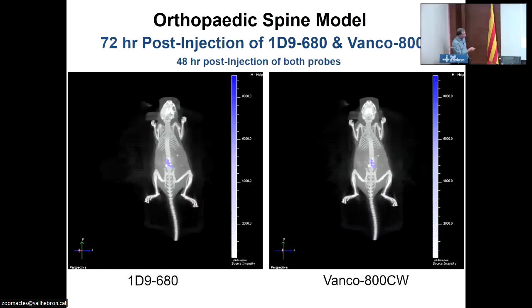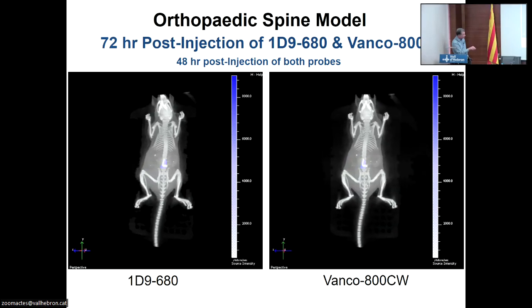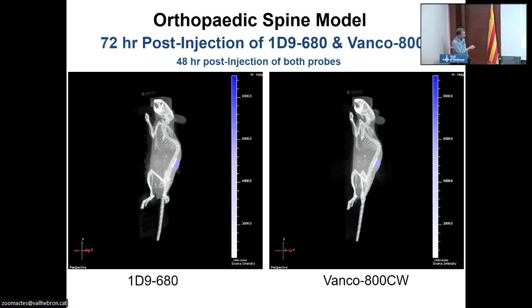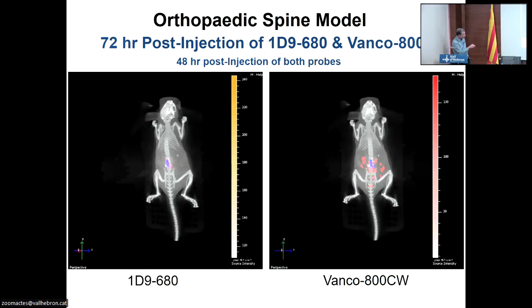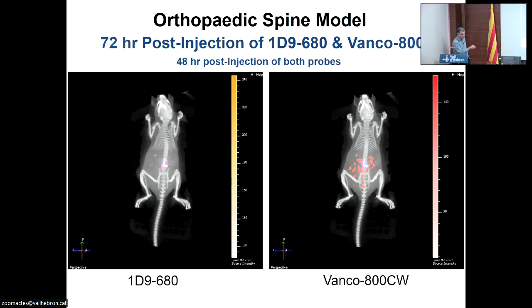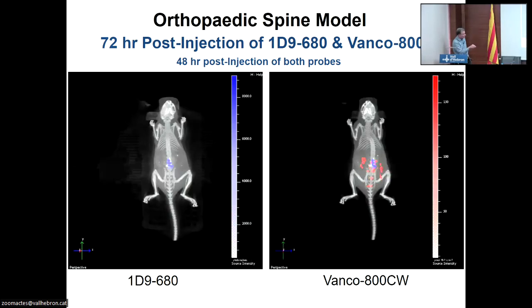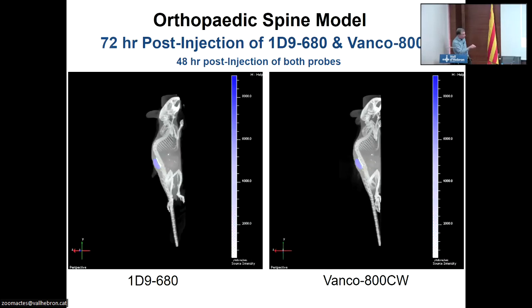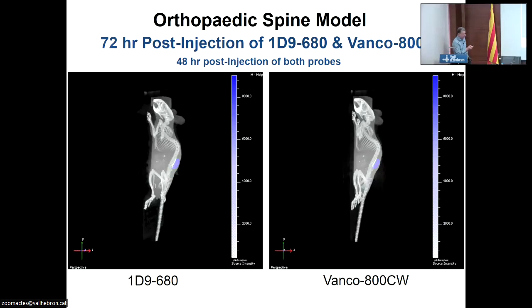And if you look at this on the film, you can see that here. So this is the antibody using a 680 nanometer fluorescent dye, and you can see the antibody binds to the bacteria very specifically, whereas the vancomycin binds to the bacteria, but it also breaks down. After 3 days, it's 72 hours, or 48 hours here, the probe starts to break down, and so it doesn't target specifically, it's also non-specific as well.